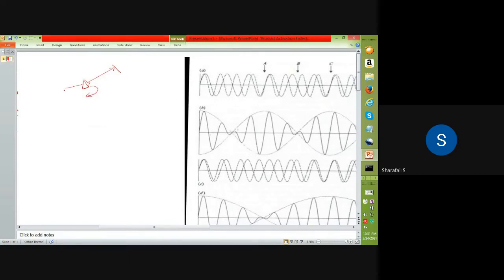So we have an IR branch, or for example, near IR region, all those frequencies which are coming from the source and which is hitting on this particular prism. So from the source, all those range of frequencies are coming.